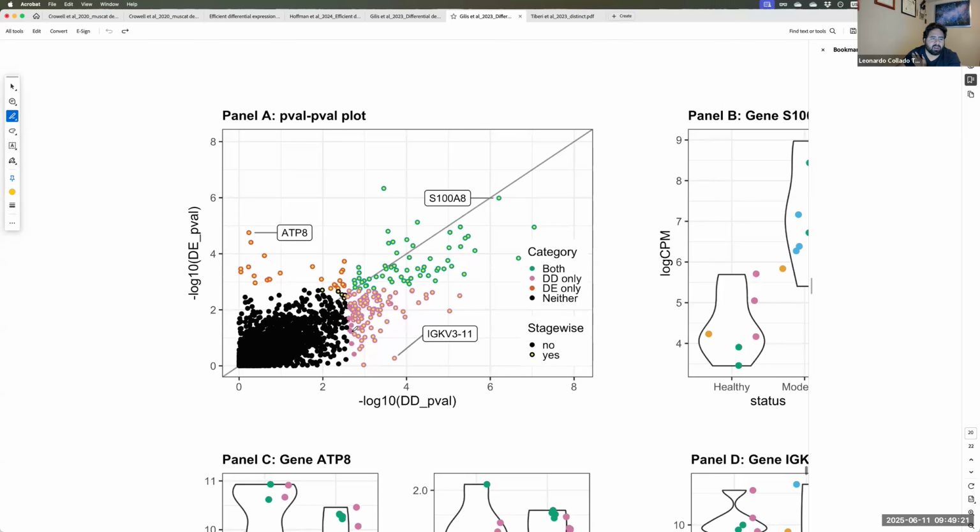That's because they end up not being significantly differential once you take into account the p-value distribution across the two analyses together. You also see some black points that then have yellow circles, but it's mostly the other scenario: stuff that had color now has no yellow circles.